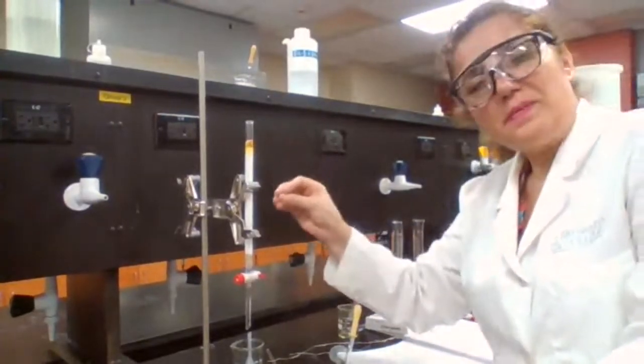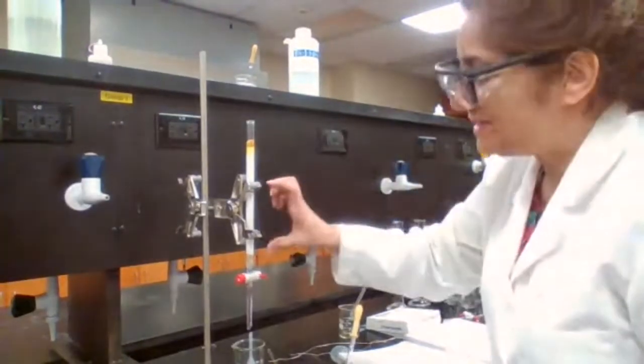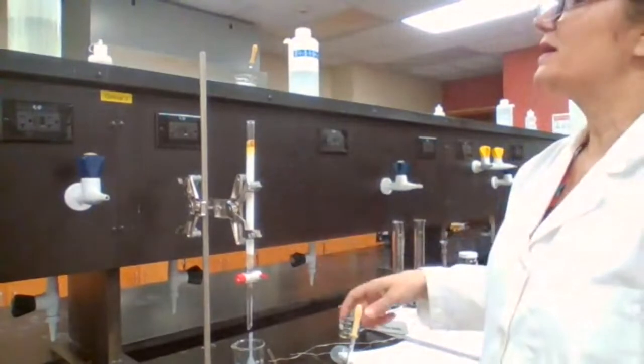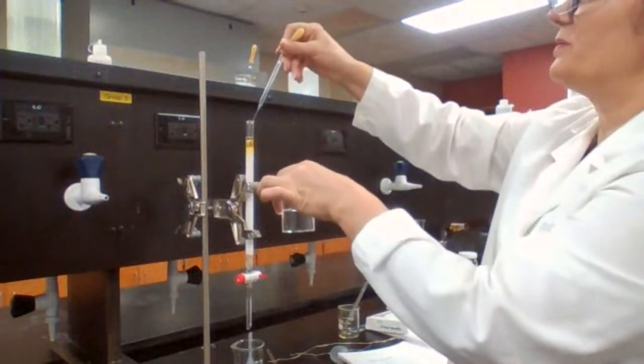The non-polar compound that is here, it's colorless. When it's in the solution, it's colorless. So it's very hard for me to see it in the column. And because it's hard for me to see it, I'm going to have to basically test for it to see when it did reach the bottom.